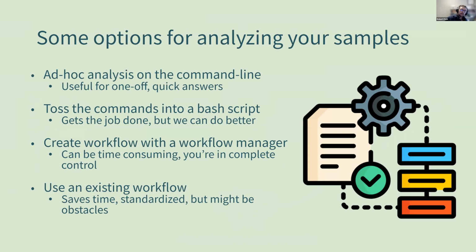And we've gone through these throughout the day. You can just play with the command line, conda install FastP and clean up your reads, and conda install Shovill and assemble the reads. You could just do that at the command line, which is very useful for one-off, very quick answers. Like someone just says, hey, I just sequenced this. Can you tell me what the serotype is? And you're like, that's fine, we can do a quick and dirty command, and then here you go. And then they may never want it again.